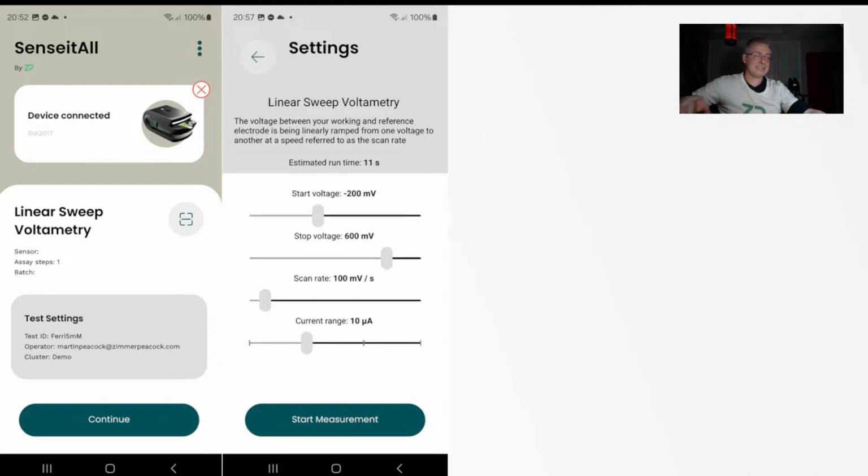I know it's stating the obvious a bit, but by doing linear sweep voltammetry, I've already halved the time to do the experiment, and then I've done something I won't call that controversial actually.